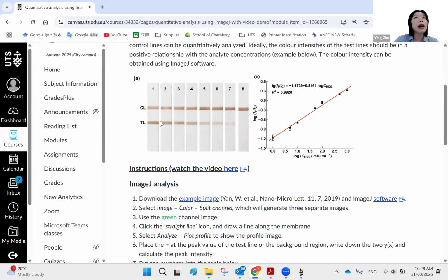So in our Hive lab, we will try to build this. We will use different concentrations of PSA analyte. What I want to point out is that building a good assay that shows different intensity with different concentration needs a lot of effort from the assay development point of view. So if in our Hive lab you don't see such a nice change of intensity, that probably means our assay is not optimized.